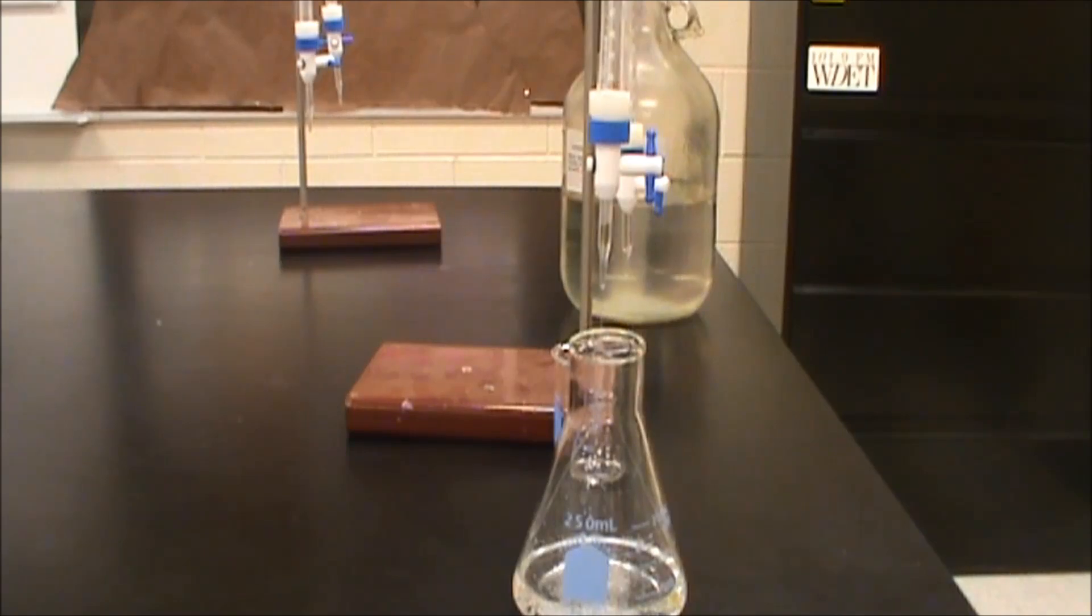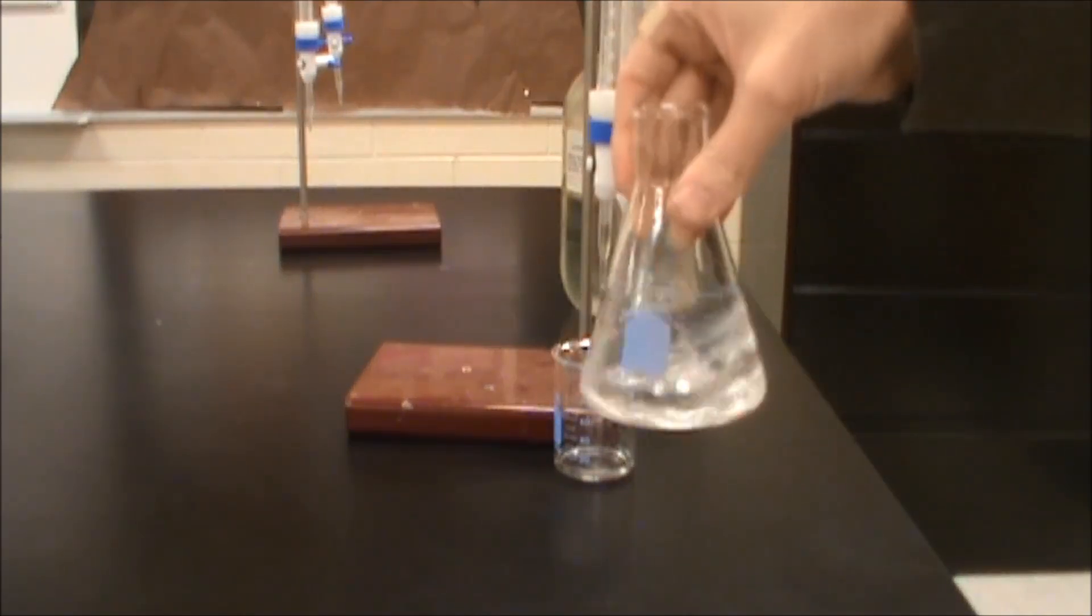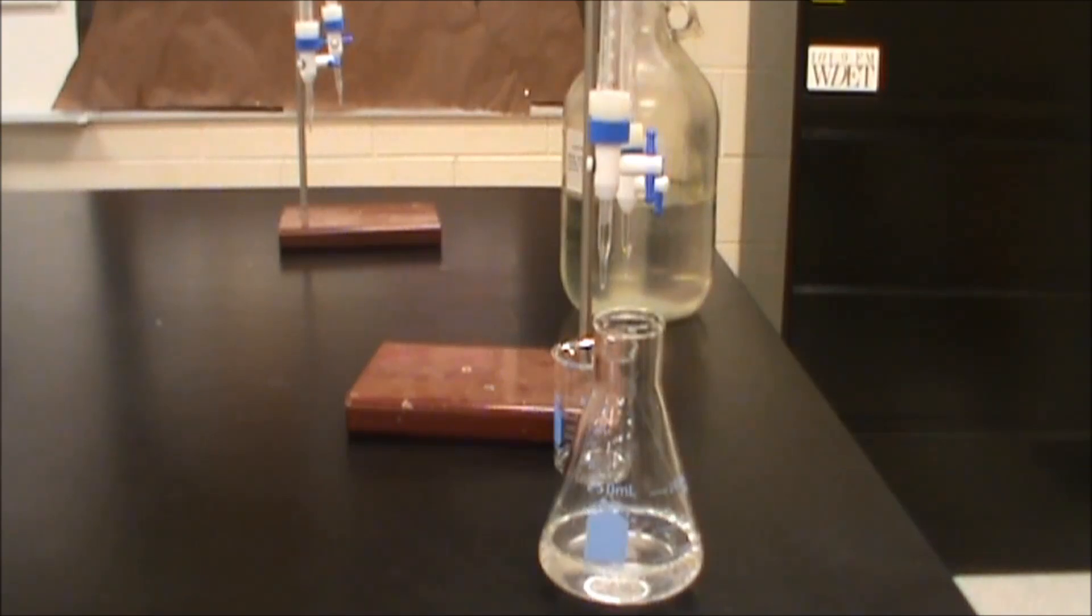Then we're going to refill that and we are going to start our titration and we're going to titrate our potassium hydrogen phthalate. 0.919 grams that are present in there in the presence of phenolphthalein.